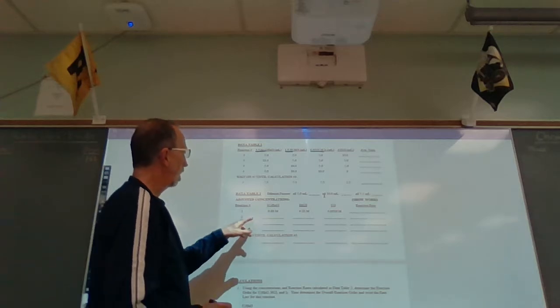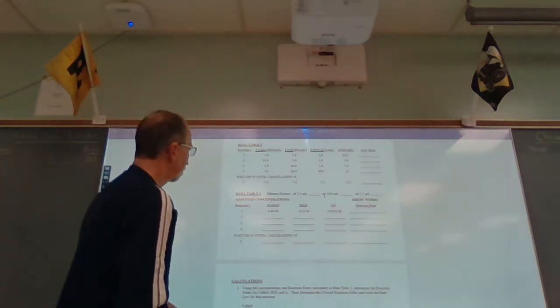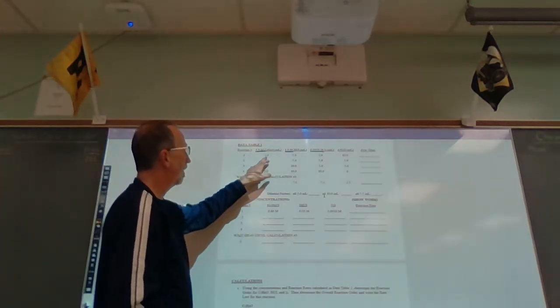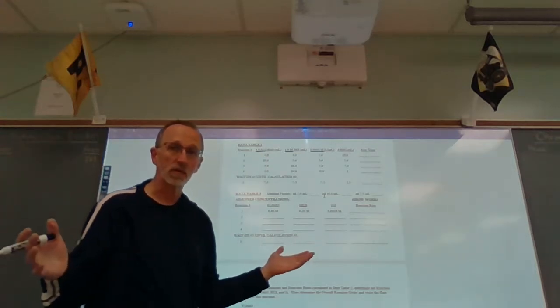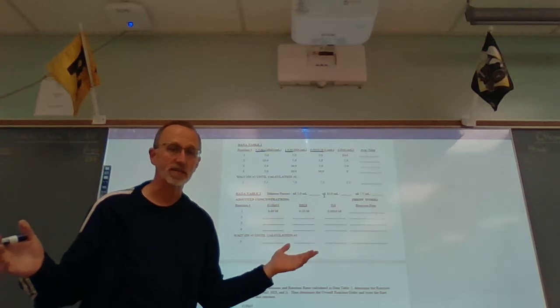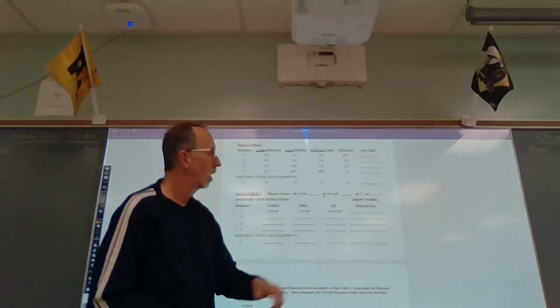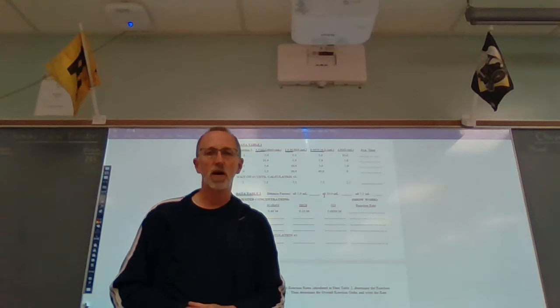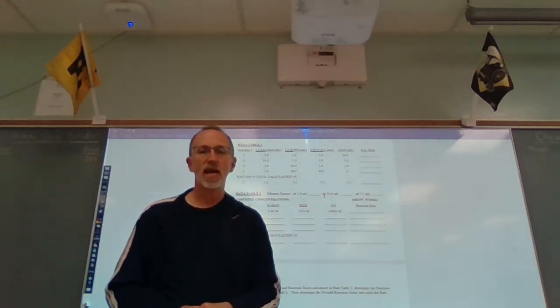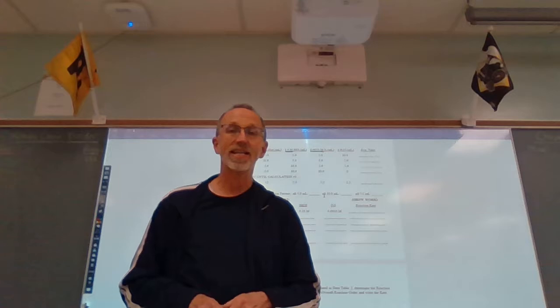So I already have some numbers written in here, and I want to explain where those come from. So let's look at this. Here we have 5 mLs of acetone, and that is just acetone. There's acetone particles in there and nothing else. But when we add in the HCl, the iodine, and the water, the number of acetone particles remains the same, but the volume of the entire solution has gone up, which means that the concentration of the acetone has been diluted.